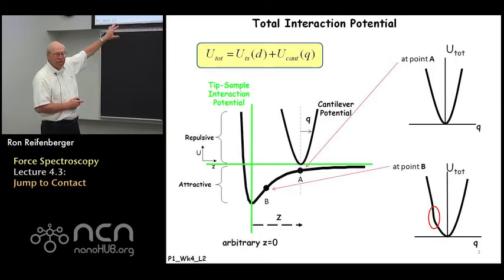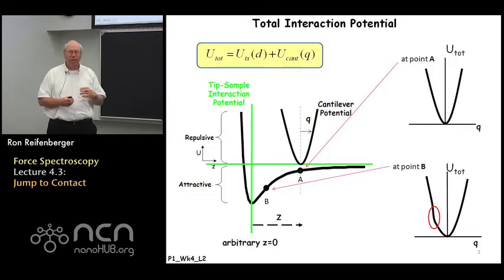So this isn't terribly relevant. The shape of this total potential well is not terribly relevant for the discussions here. It'll be discussed more in part 2 of the course, but I wanted to at least point this effect out and then use it. I want to use this concept of the total potential energy to discuss the stability of the tip with respect to the substrate.